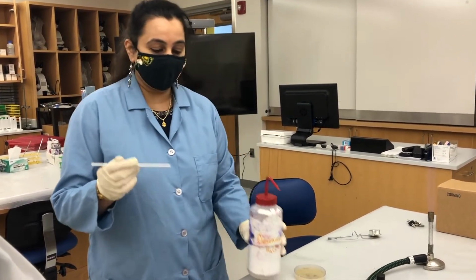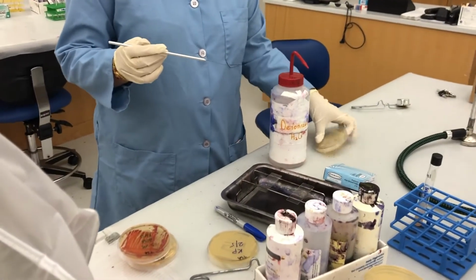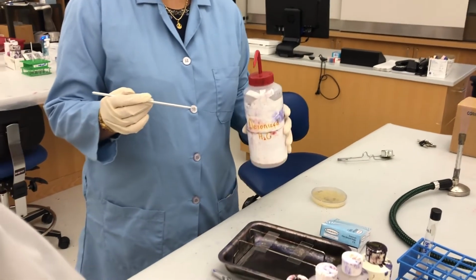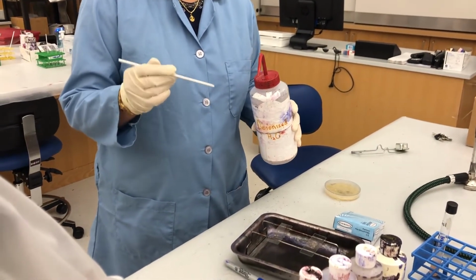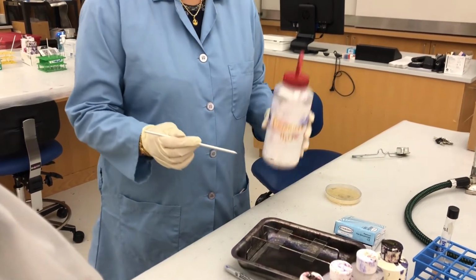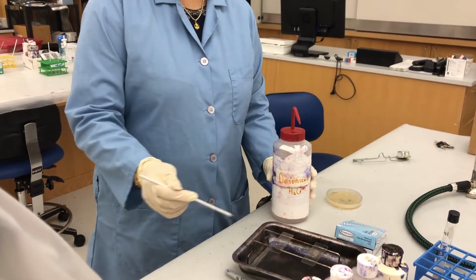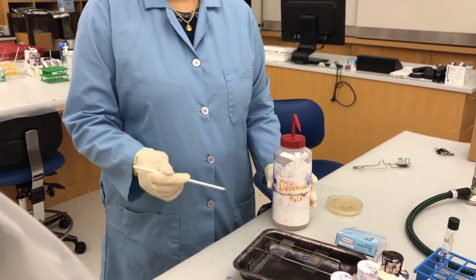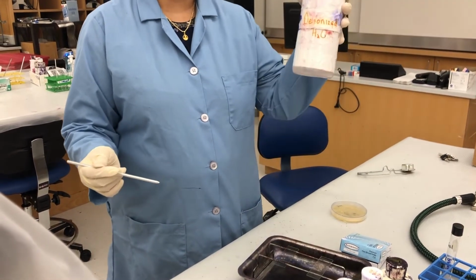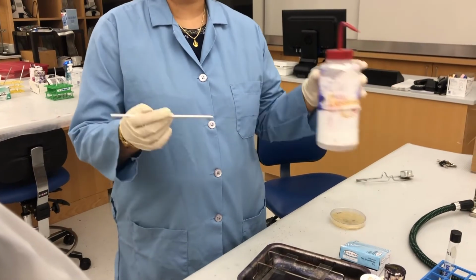Okay? Alright, so you have the bacteria here, and because we have the bacteria as a solid culture, what we need to do is add a loop full of water so that you can dissolve the cells nicely in the water. Okay? The water need not be sterile because anyway we'll be fixing the cells and we'll be killing the cells, so we are not really growing the cells, so we don't need to really worry about water being sterile. You can use the DI water right on your tables.